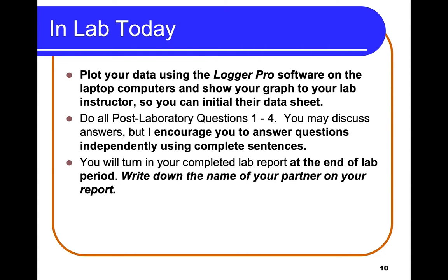In the lab today, you'll plot your data using the Logger Pro software on the laptop computers and show your graph to your lab instructor so they can initial your data sheet. You're going to do all of the post-lab questions 1 through 4. I encourage you to look at the questions and think about them a bit before you write your answers, but it's fine to talk to the people that are around you. But I would ask that you think a bit independently, and then when you answer them, you want to answer them in coherent, clear, complete sentences.